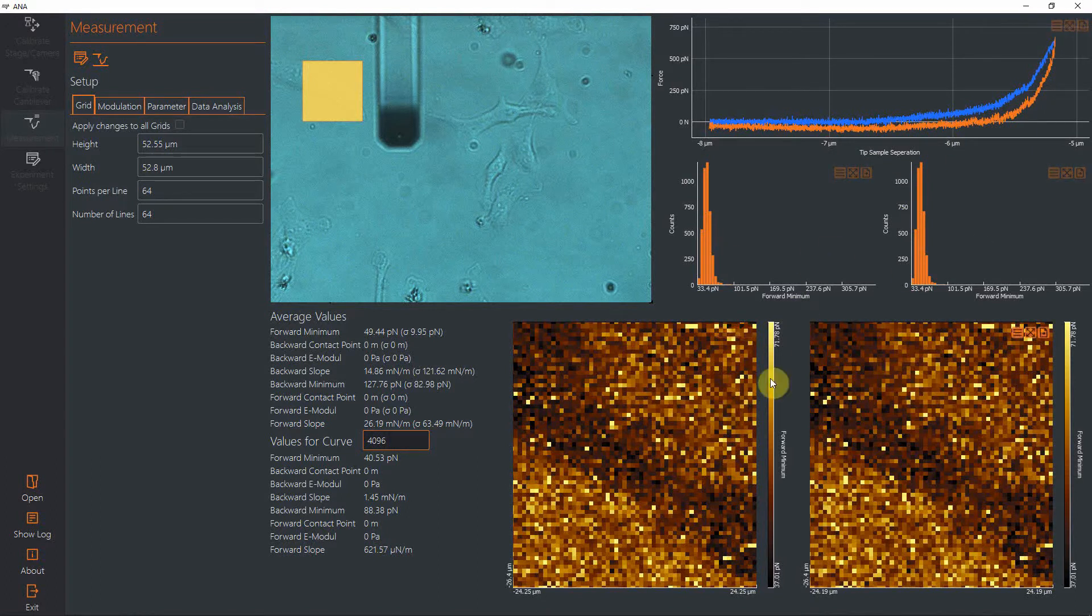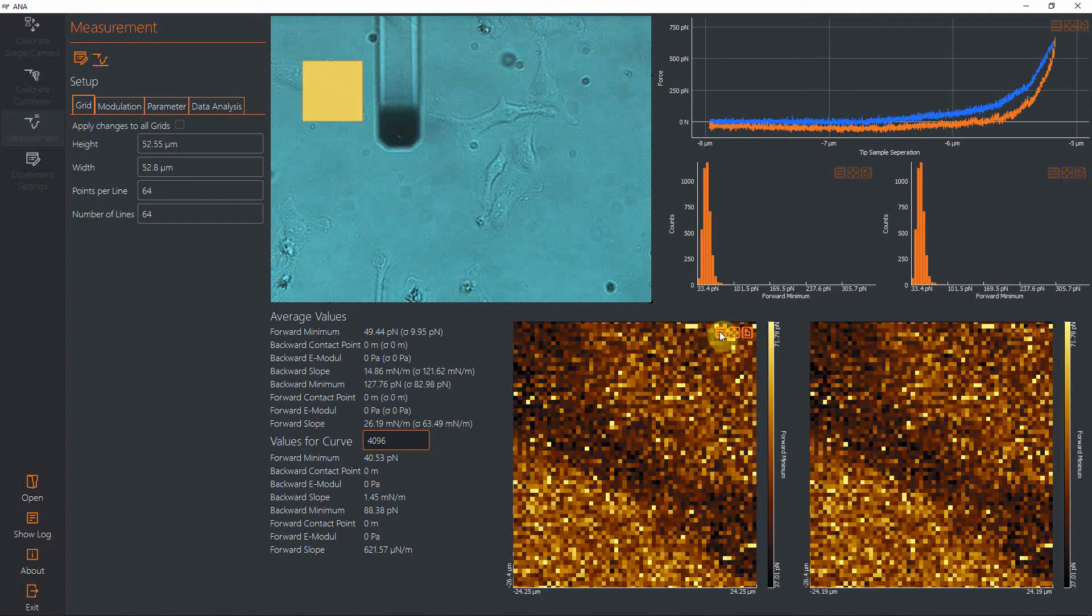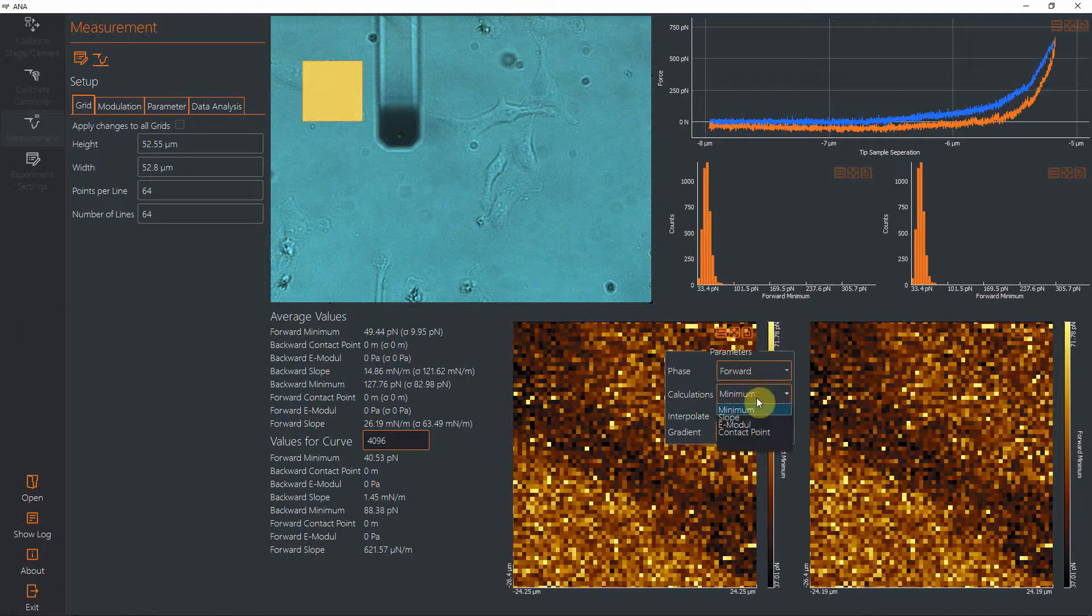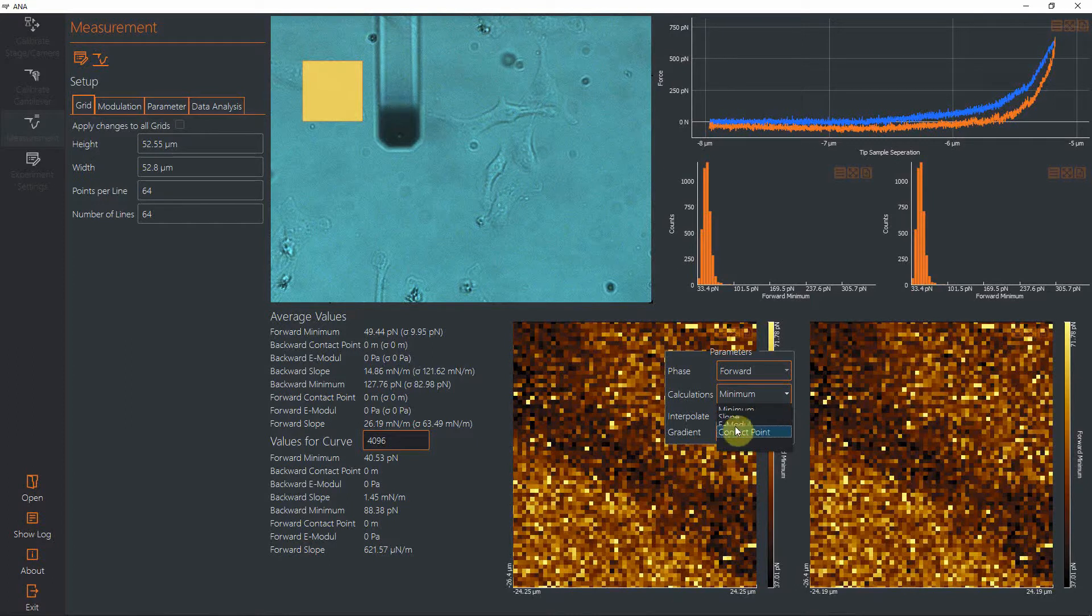After this is done, you get up here the force distance curve—blue is forward, orange is backward. You get histograms, two pieces of histograms, and you get two color maps. The channels that you display, for example in the color map or the histogram, can be accessed via this drop-down menu. You can select if you want to have the forward or the backward results. You can look at the minimum, which would be snap-in on the forward trace, and the adhesion force on the backward motion. You can also look at the slope.